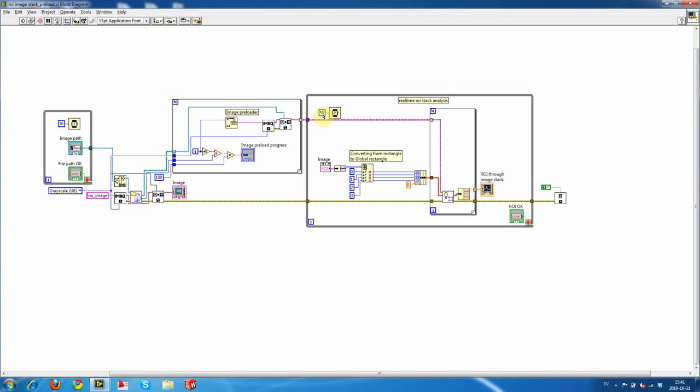We could probably run this a little bit faster, but it's analyzing a large data set. So we've got 350 images that it has to read a small subset of the image and then figure out the intensity, which itself is a very simple task, fractions of millisecond time, but due to the fact we have hundreds of them, it's advantageous to put a time delay so that it doesn't try to run too fast and possibly get an error.